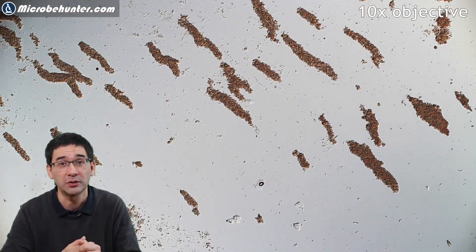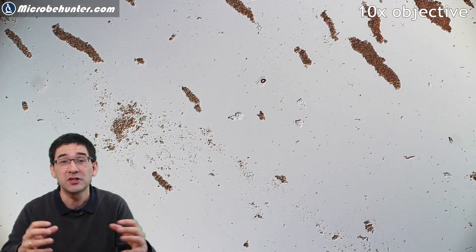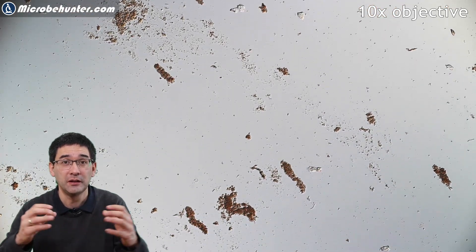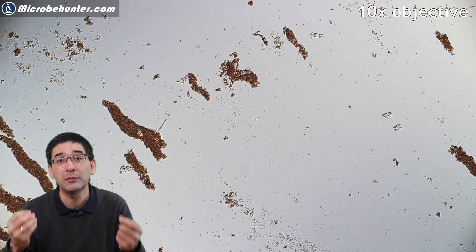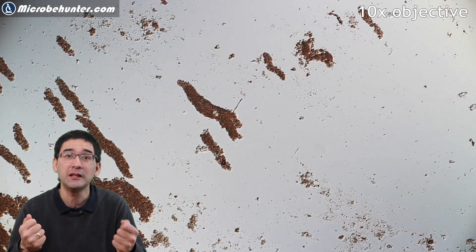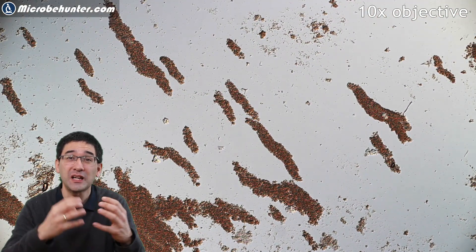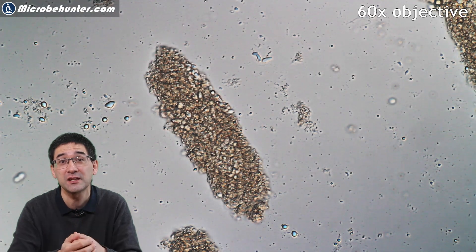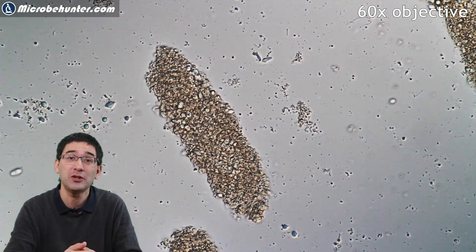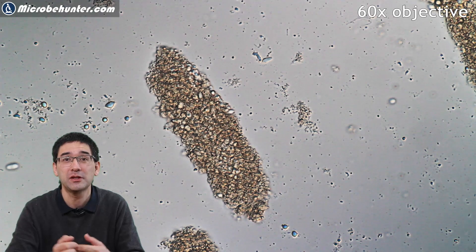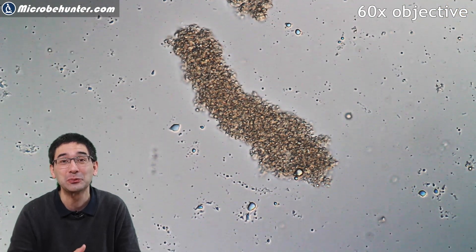And this is where it actually got a little bit better. The clusters were not as large, but a little bit smaller. But still, I was not able to see the individual bacteria and the individual fungi as well, because they were sticking together. And when I increased the magnification, the same problem. So essentially, the contrasting technique that I used was probably not the best one.